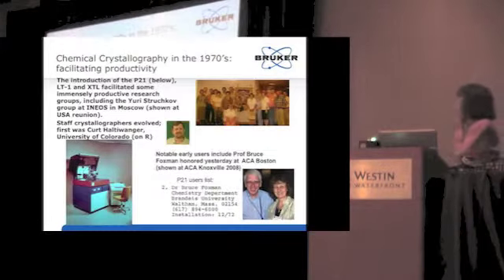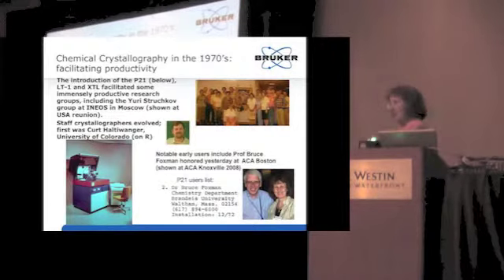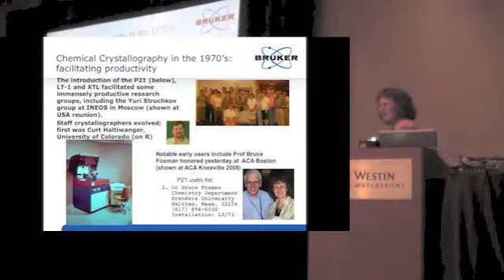And indeed, this was something really important that Bob Sparks instilled in all of us, that at every ACA or IUCr meeting, we needed to introduce something new. And so there were milestones in particular in the software development. In 1970, which happened to be the first ACA meeting I ever attended, Bob Sparks introduced auto-indexing, and I heard that talk. It was a miracle because I was not yet associated with the company. So I think I decided at that moment that this is where I wanted to be.